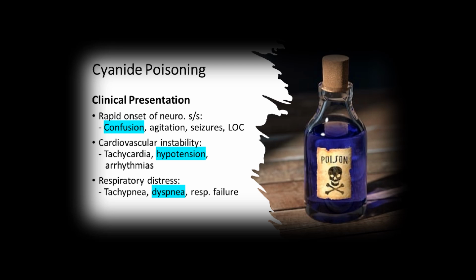If you suspect cyanide in your concentrate or ore, the cyanide must be removed prior. In order to destroy the cyanide before the group 1 separation, add concentrated nitric acid to the sample, then evaporate to dryness in a water bath. Cyanide will react with the acid to produce a deadly, toxic gas, hydrogen cyanide. It also prevents sulfide from precipitating. You need to complete this procedure using a fume hood or outdoors with the wind at your back. Cyanide gas will kill you quickly. You can then add the diluted hydrochloric acid. Heat the sample in a water bath for an hour to bring it back into solution. Hydrogen cyanide is volatile in an acidic solution.